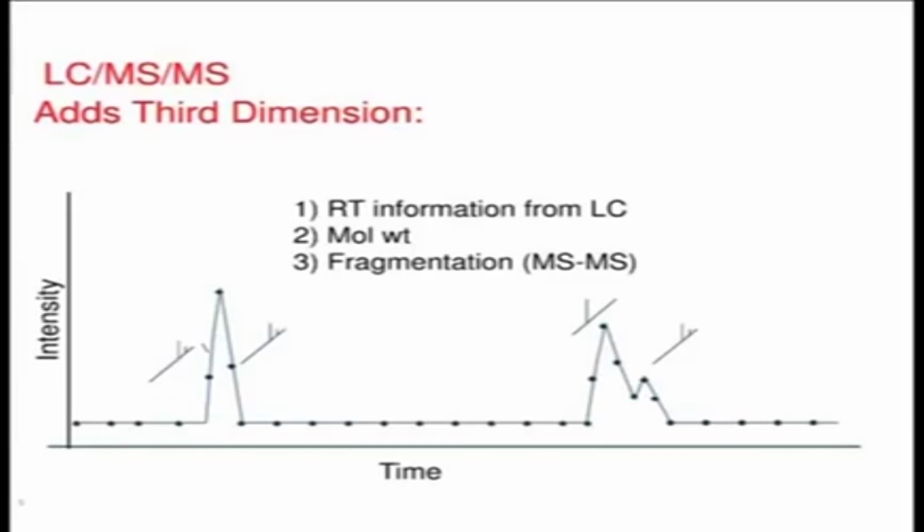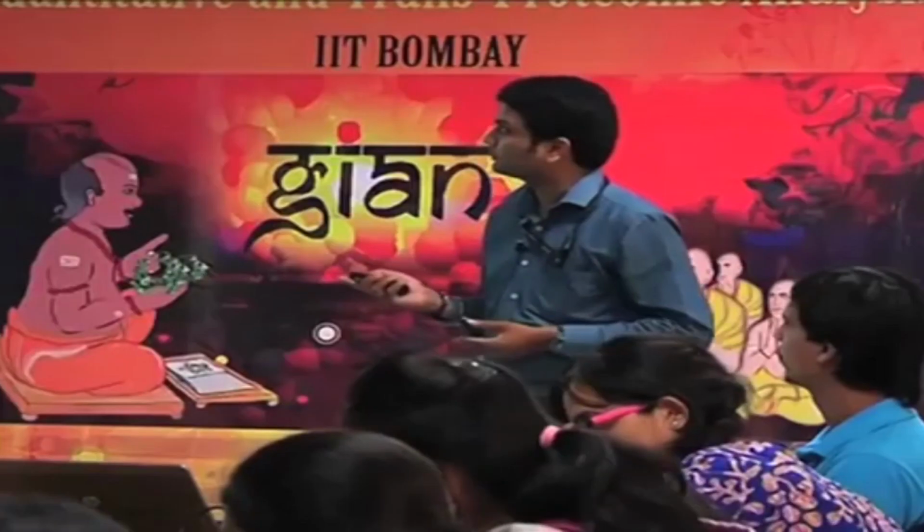But when you do the fragmentation, the product ions formed for the compound of interest and the interfering molecule will be different. Therefore, you have to focus on the product ion that is specific for your compound of interest. In that case, you can avoid the detection of the interfering molecule, and you can quantitate your compound in the presence of different biological matrix or interfering molecules.